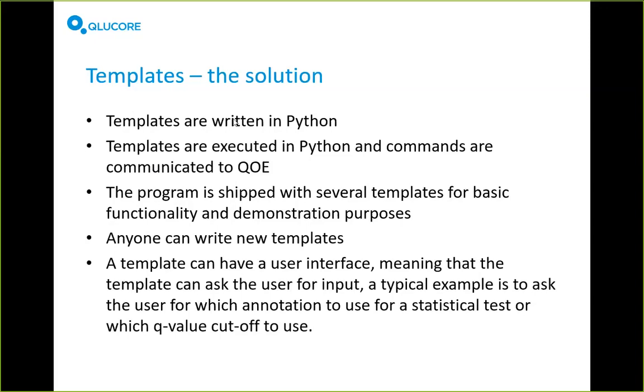Now, when the template executes, it actually executes in Python and sends commands to Omics Explorer, and Omics Explorer parses those commands and does things to your running instance of the program. We do ship the program with a full installation of Python, and we also ship the program completely out of the box, ready to run these templates.